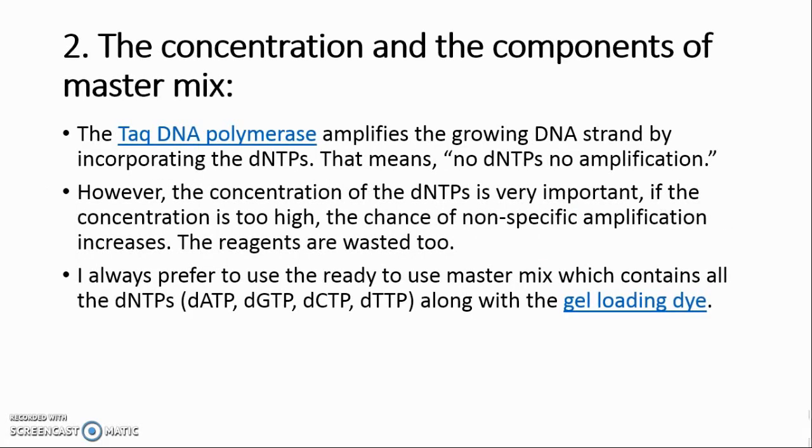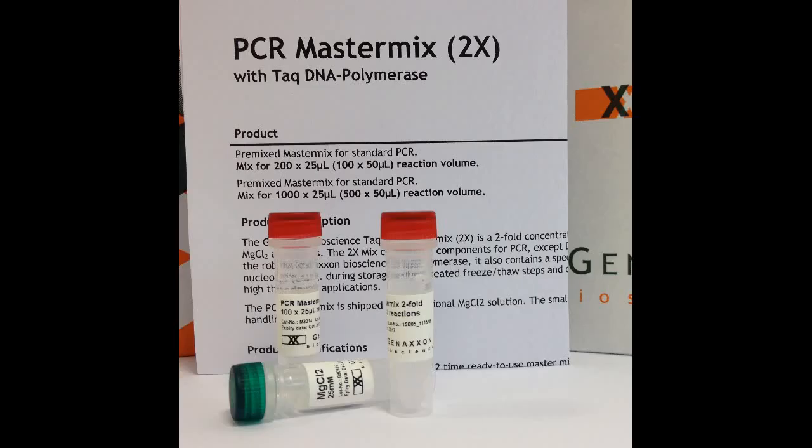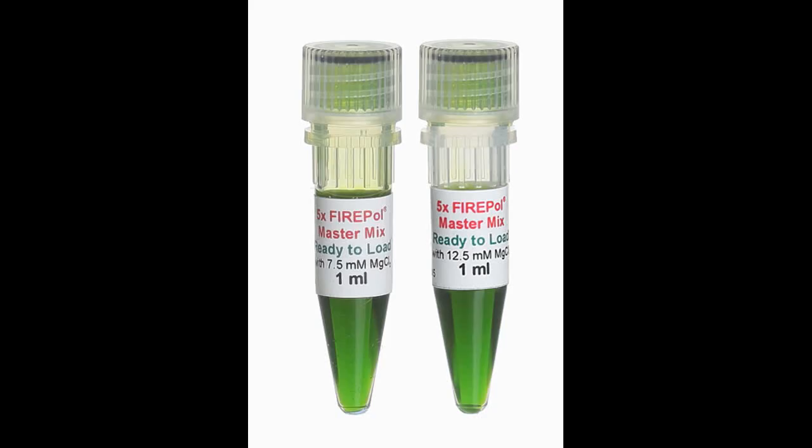Secret 2: The concentration and components of the master mix. Taq DNA polymerase amplifies the growing DNA strand by incorporating dNTPs — so no dNTPs means no amplification. However, the concentration of dNTPs is very important. If the concentration is too high, the chance of nonspecific amplification increases and reagents are wasted. I always prefer to use a ready-to-use master mix which contains all dNTPs: dATP, dGTP, dCTP, and dTTP, along with gel loading dye.